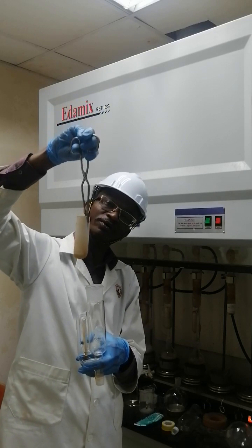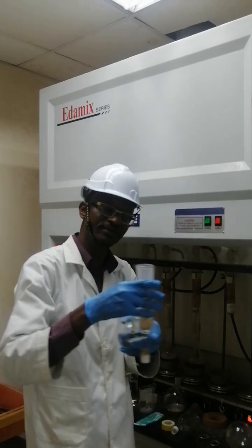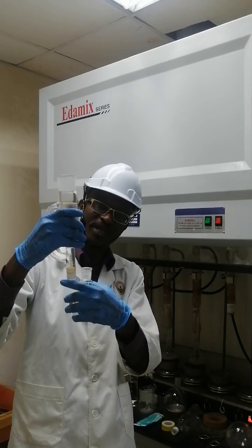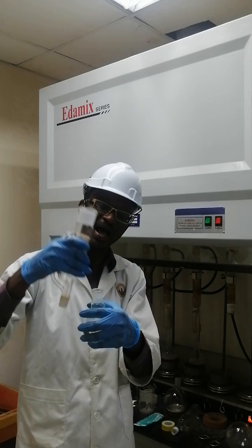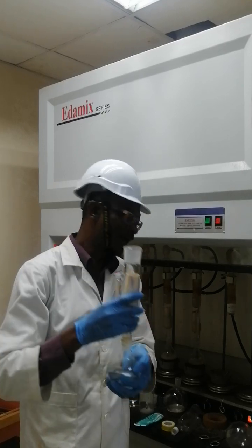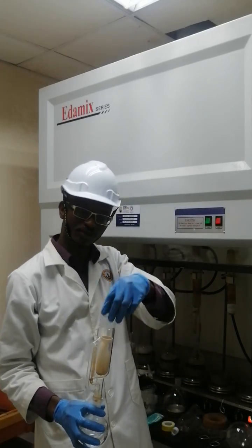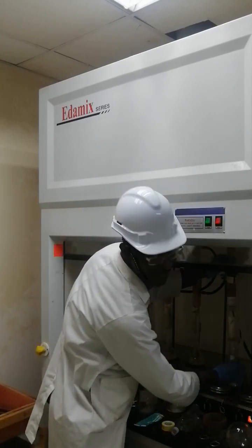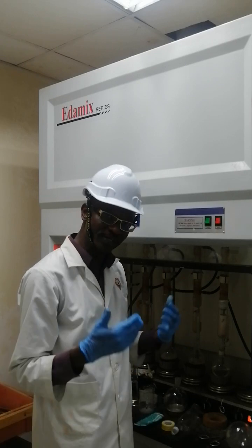So once you load your solids into the thimble, you can place it in the extraction chamber. And then you put it on through the ground joints. Both the extraction chamber and the round bottom flask here have ground joints which enable a perfect fit of the two. And then after that, you can slot in this tip, which is also another ground joint at the top of the extractor, to the condenser. The upper part, the third part, is the condenser, in which water flows for cooling.